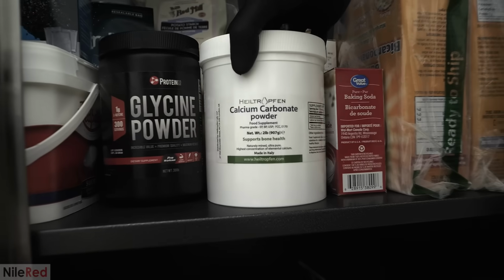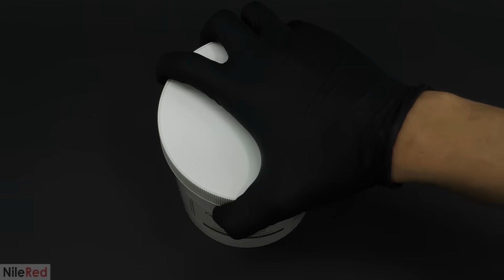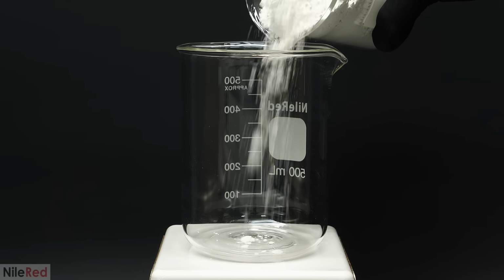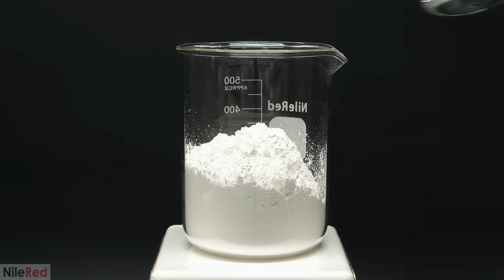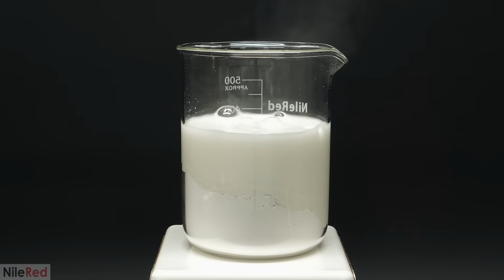I went and got some of my food-grade calcium carbonate, which is basically just chalk. I would be using this to neutralize all the sulfuric acid, but I couldn't just throw it in as a powder. I had to make it into a slurry, and based on my calculations, I needed about 245 grams. So I measured that out and added 125 mils of water.